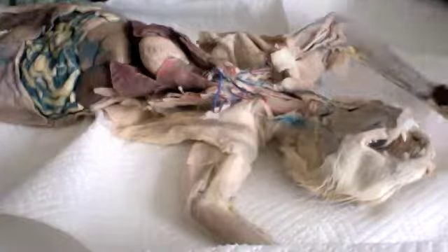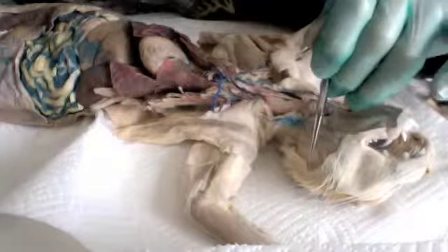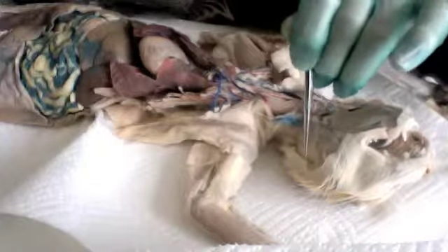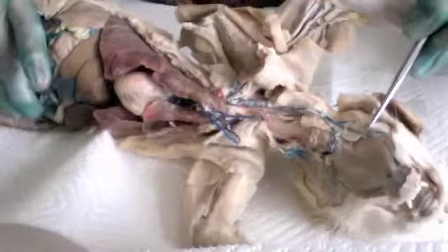Okay, we're going to start off with the salivary glands of the cat. The first salivary gland I'm going to display is the parotid gland, and that lies on the cheek just inferior to the ear. Then the second one we're going to discuss here is the parotid duct. It runs over the masseter muscle. So this is the parotid duct right here.